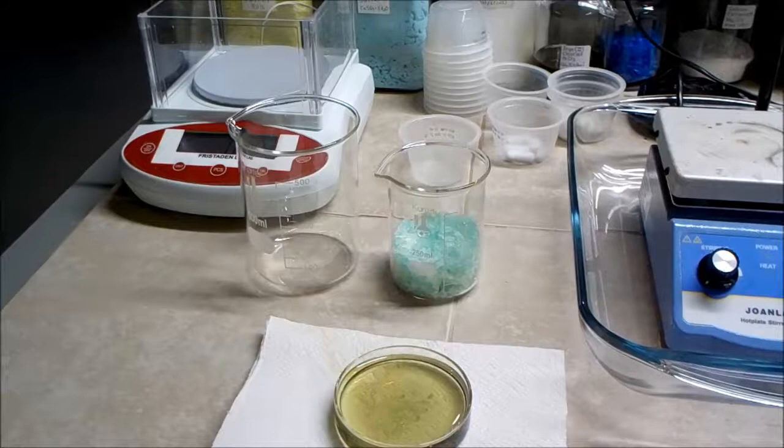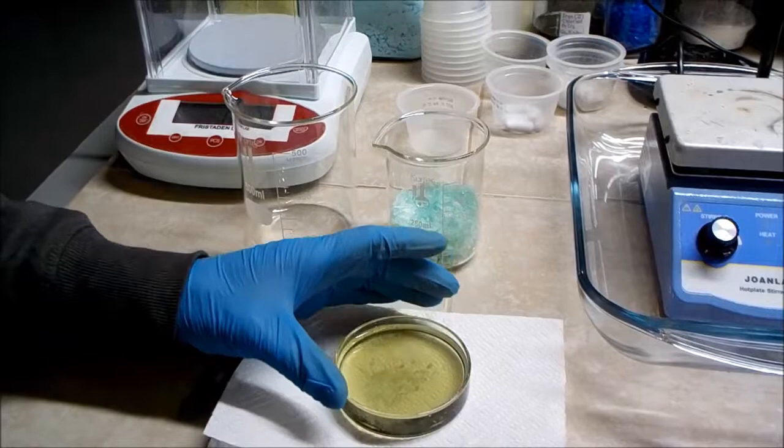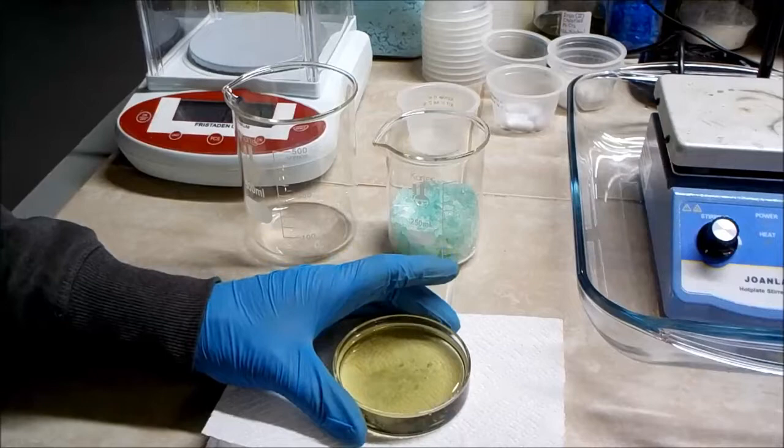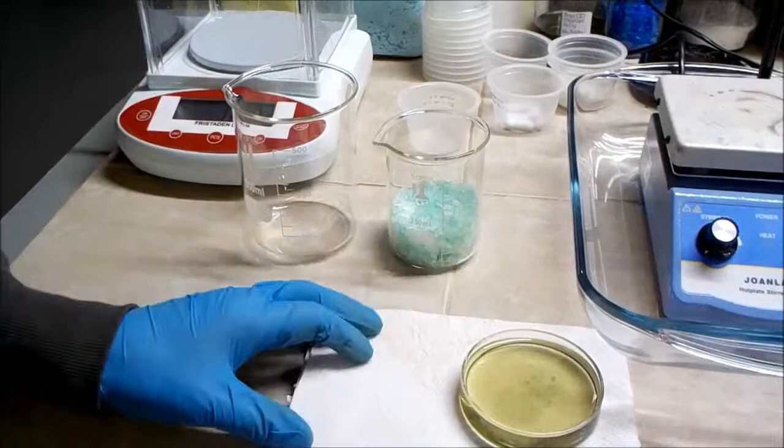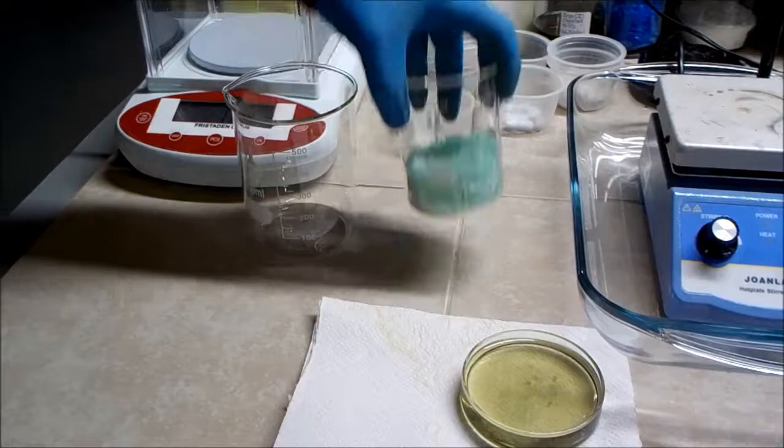So here's a little bit of the Mohr salt solution that has not yet evaporated and crystallized. But I'm not going to wait for that to finish. I want to end this video. So I'll just be setting this aside somewhere and let it set for a long time and come back to that later. So right now, here's what I recovered of the crystallized Mohr salt.